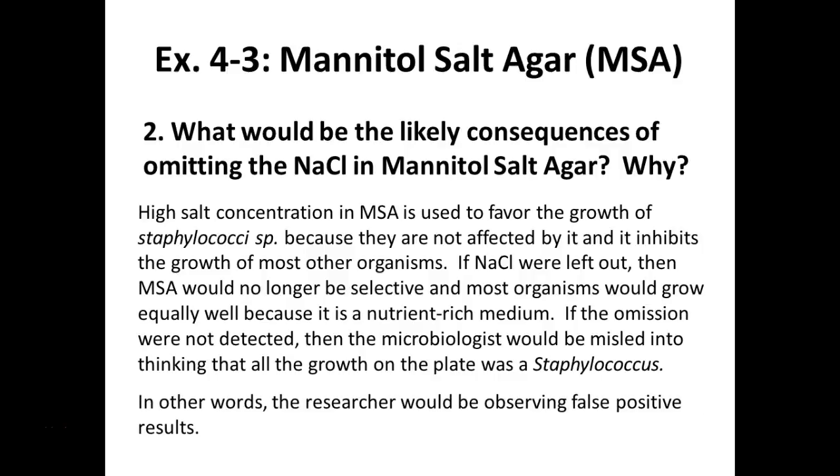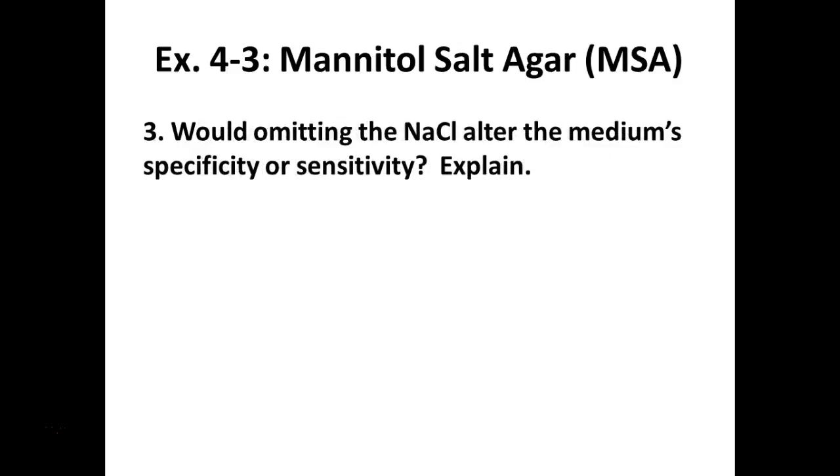You would get a bunch of false positive results because you'd have organisms growing on those plates that aren't supposed to be growing. Would this affect the media's specificity or sensitivity? This would be specificity, right? It would no longer be specific for salt-tolerant organisms.